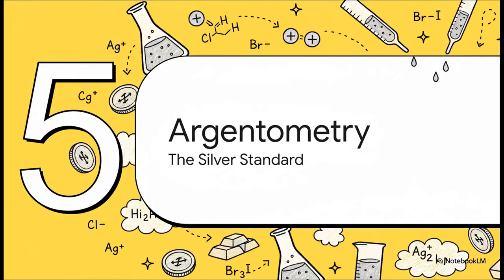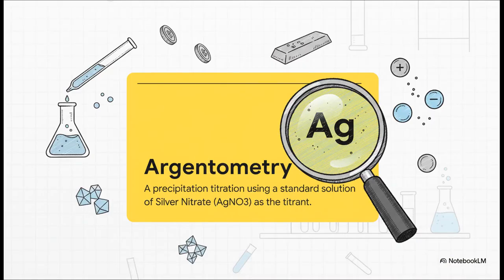Okay, so we've got the theory down. Now let's see how this all comes together in one of the most common and, honestly, classic methods of precipitation titration. Welcome to the world of argentometry. The name sounds fancy, but it just comes from argentum, which is Latin for silver. Why? Because the absolute star of this show is silver nitrate. This method is the gold standard, or I guess the silver standard, for measuring things like chloride, maybe in your tap water or in table salt.